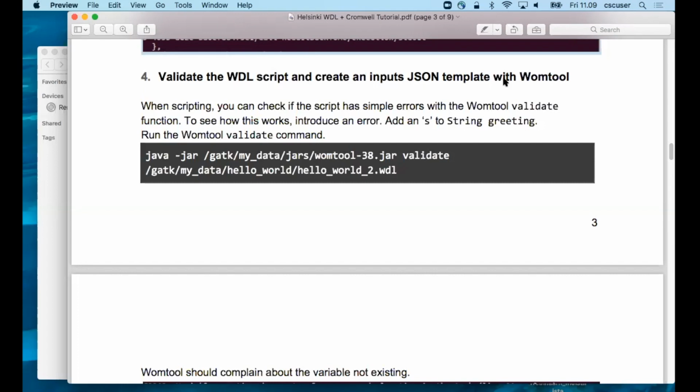There's more than just line tabs. There's a few other code editors that have highlighting. If you like a more traditional IDE-like development environment, IntelliJ and PyCharm from JetBrains are very full featured. But if that's overkill for you, it's fine. So where did it open though? Which file does it open? It has automatically opened one file. You can choose. Open the file.